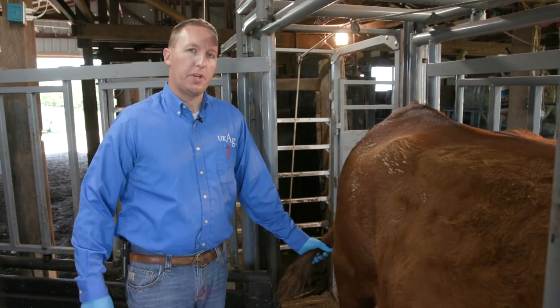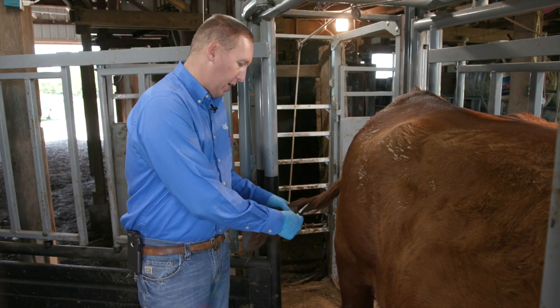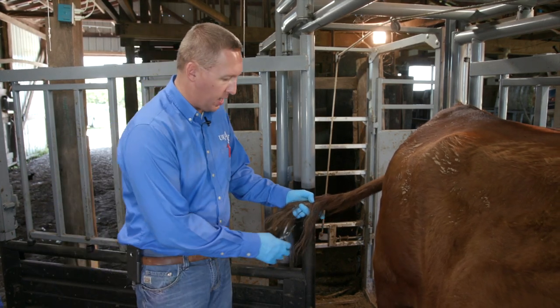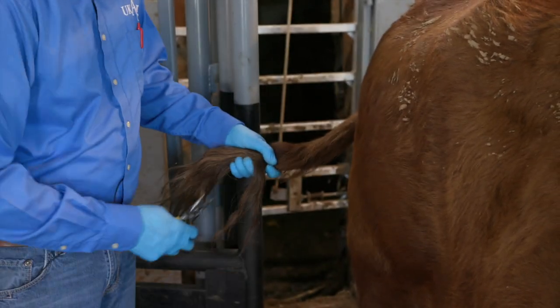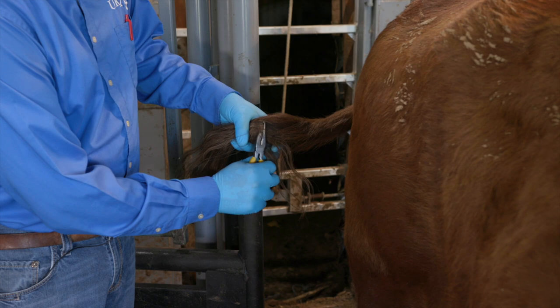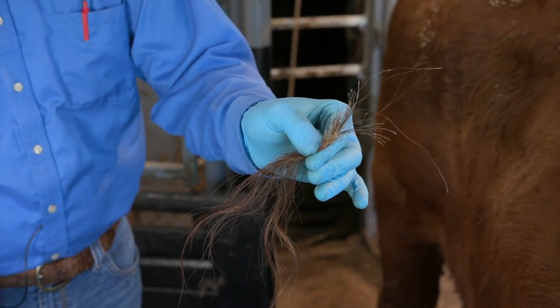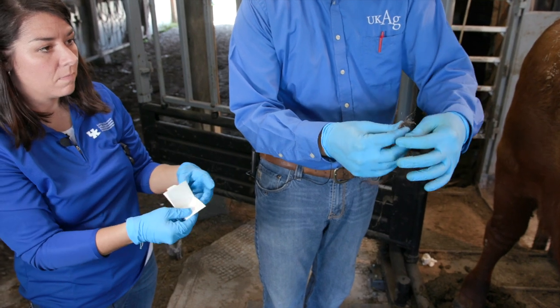Here we are at the rear of the cow taking a hair sample for DNA testing. The switch is by far the easiest place to do this. We're looking for anywhere between 30 and 60 hair follicles as the test calls for. We're not worried about the shaft of the hair — we're actually worried about the root that's underneath the skin, because that's where our DNA is contained in those hair samples. I've got a simple set of needle nose pliers cleaned with alcohol prior to taking these samples. Instead of pulling down, the easiest way is to kind of roll and twist it around the needle nose pliers and then pull up. As you can see we have a lot of root material on the end of those hair follicles — that is a really good sample.